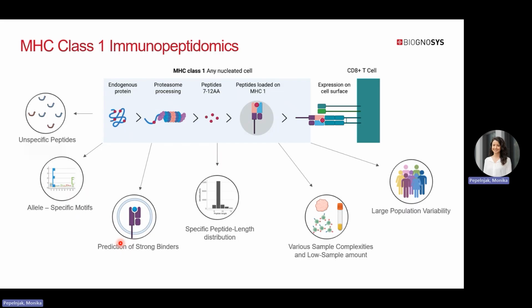Because of this, traditionally DDA was used to analyze immunopeptidomic samples. However, we wanted to see whether we can tackle the same questions with DIA data in a directDIA mode.